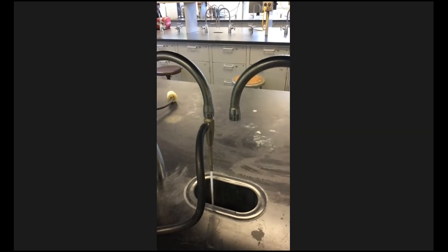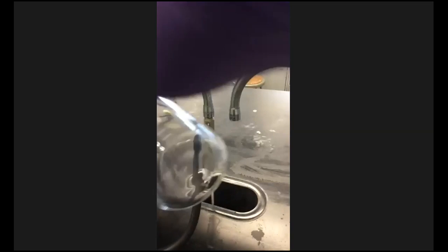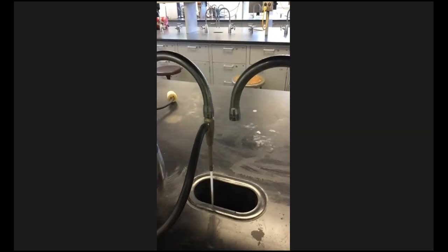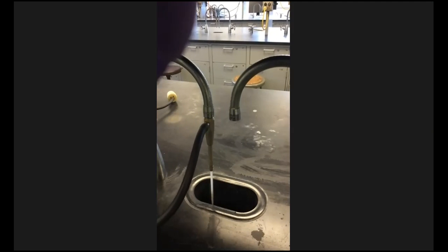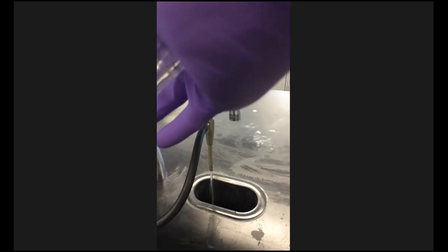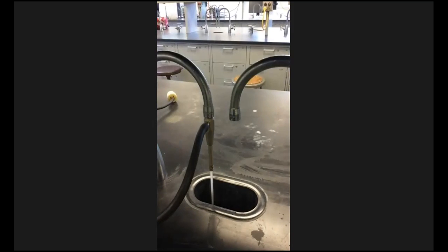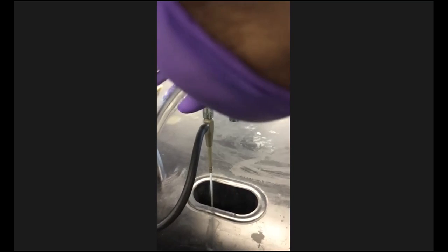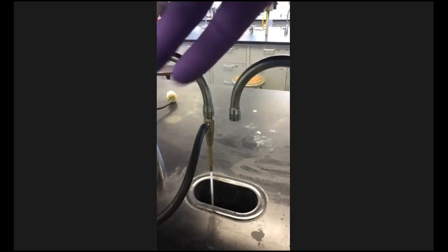And so you get to set up, let me see if I can do this little trick. No, if it's good vacuum and you have on a pair of gloves with some slack in it, you can see it pull the glove down into the flask, but this is not that good. The vacuum here has never been that great. Did y'all hear that though? So it is pulling, it's just not that great.